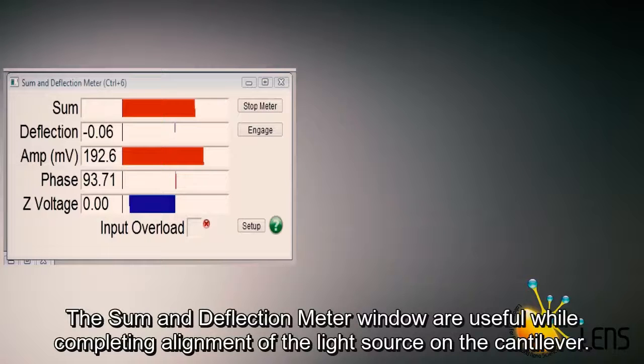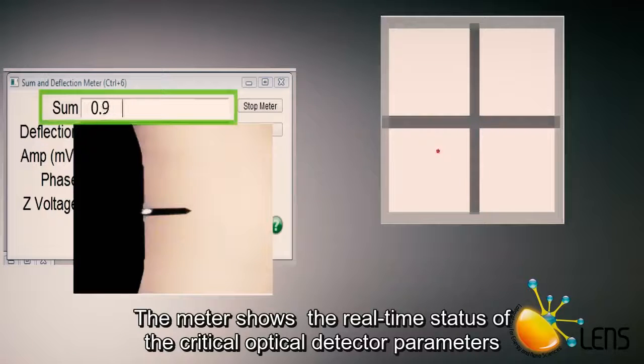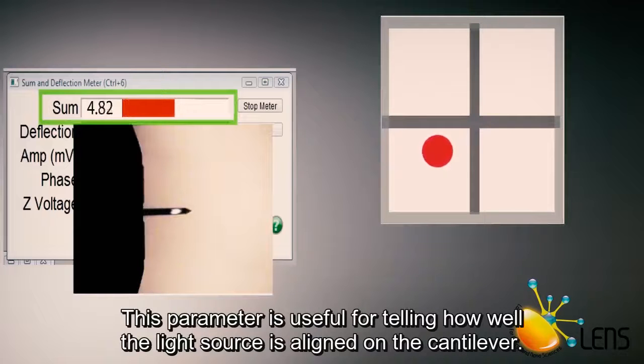The sum and deflection meter window is useful while completing alignment of the light source on the cantilever. The meter shows the real-time status of the critical optical detector parameters. The sum is the total amount of light collected by the photodetector in volts. This parameter is useful for telling how well the light source is aligned on the cantilever.